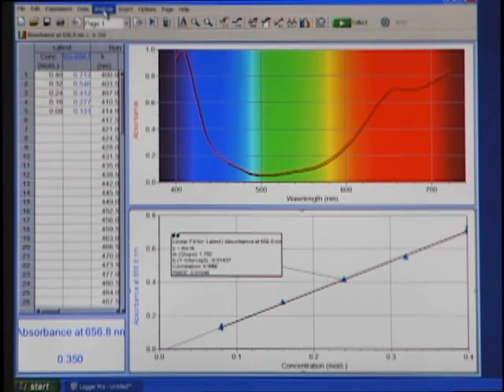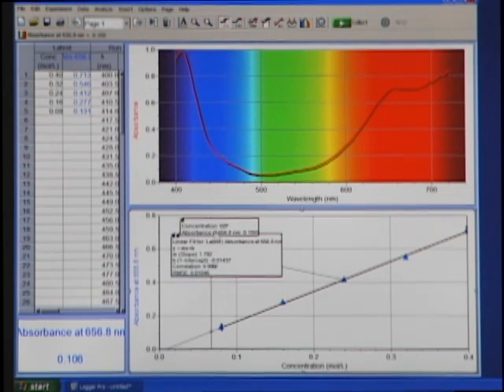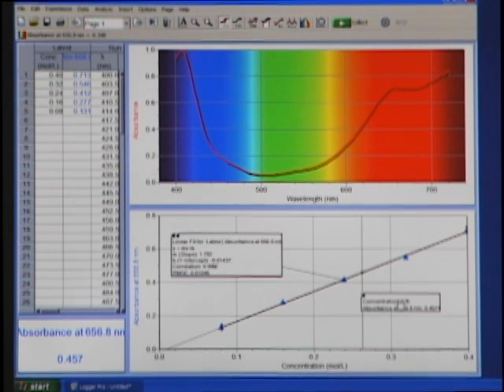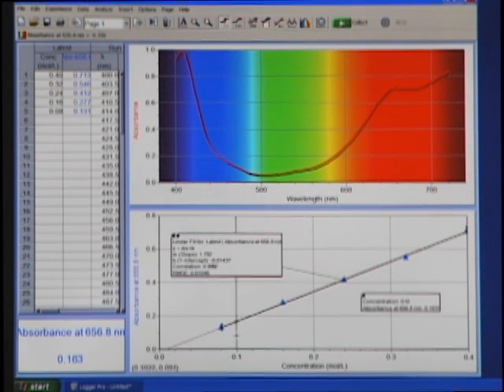Now I'm going to go to the Analyze menu and choose Interpolate. I'm going to drag that box down to the lower part of the graph here where we can see it. Notice that as I do that, there's a little circular cursor somewhere along the, as I move along that linear regression line, notice that it updates in the box the new concentration and the corresponding absorbance value where I'm displaying. So I had a value of 0.356.